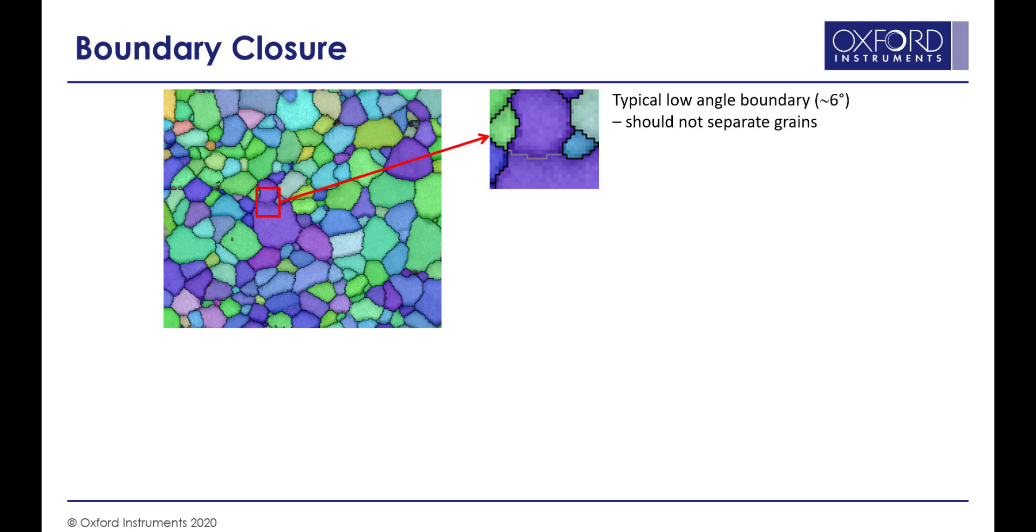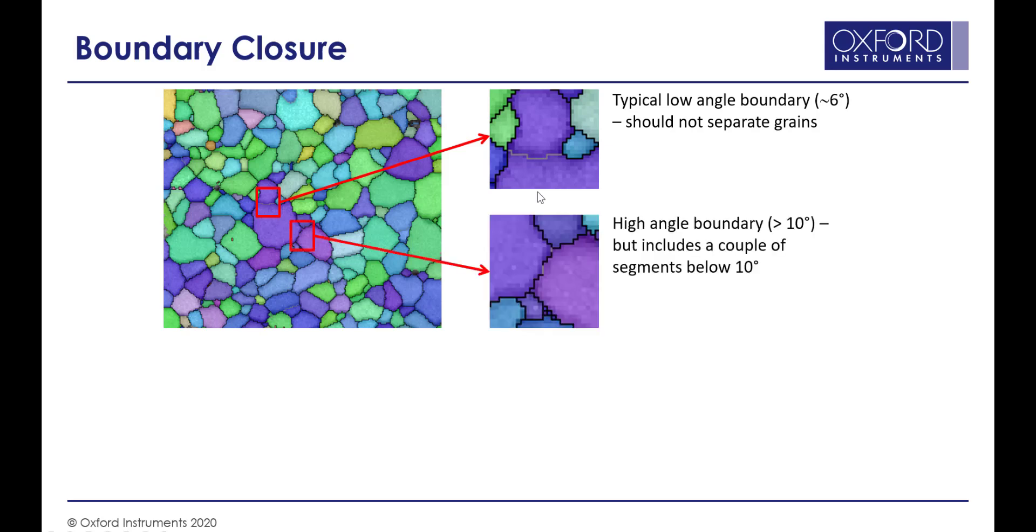We wouldn't normally want to separate this grain into two separate grains. This is all part of the same grain, but it has a subgrain included within it. However, down at the bottom right of the same grain, we can see that there's a boundary which has got a disorientation above 10 degrees, as shown by the black line.